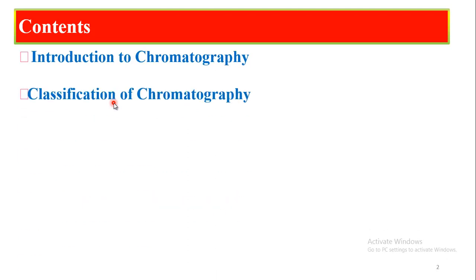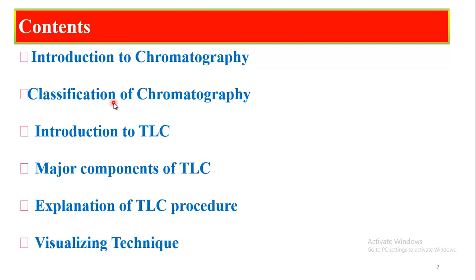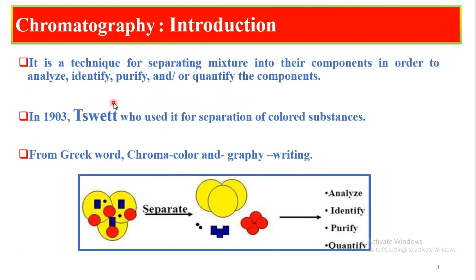The content of the video is, first, what is chromatography, then I will discuss different classifications of chromatography, then an introduction to our main topic, thin layer chromatography, its major components, and explanation of the procedure to perform the TLC practical, and visualizing techniques which are used for TLC.